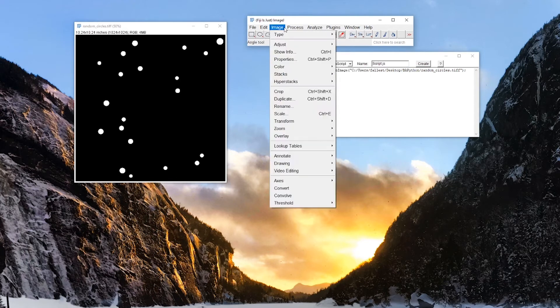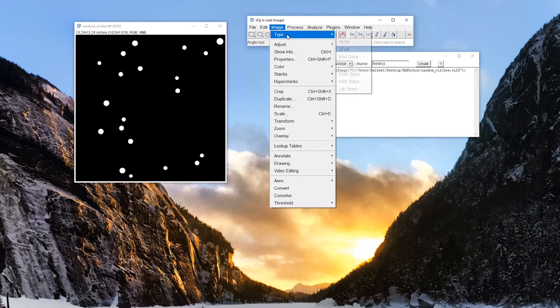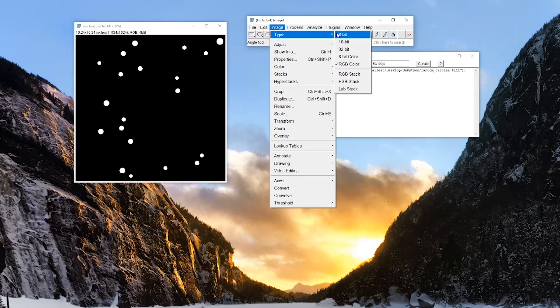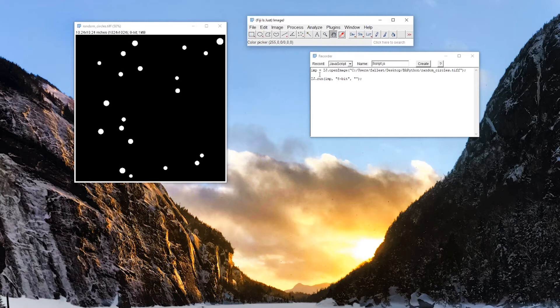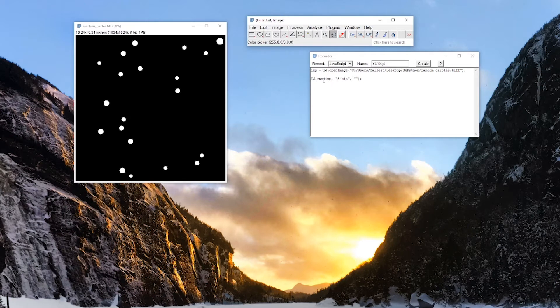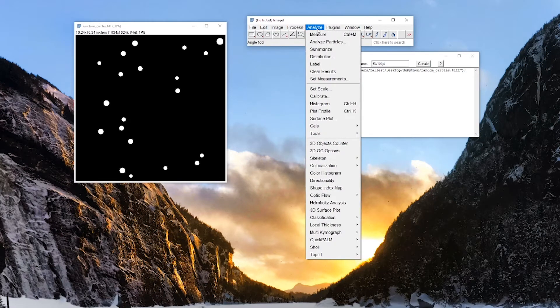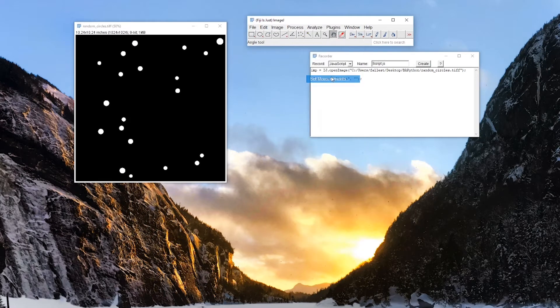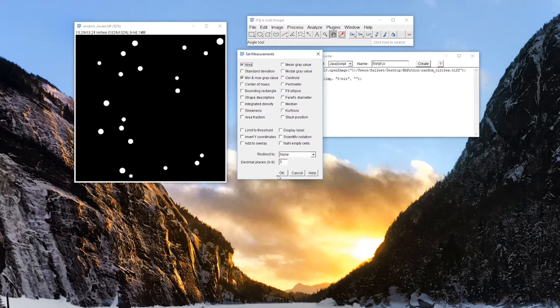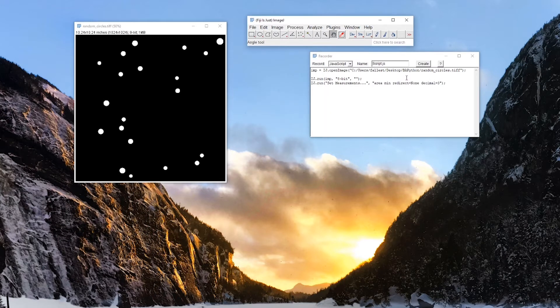Let's go back, image type, 8-bit. So IJ.run imp. So it's taking this variable here, imp, putting it into the function run. So IJ.run imp, and it's just launching 8-bit on it. All right, so now we can set the measurements we want. Area, min, max, gray value. Okay, so IJ.run, set measurement. So it's just running that function right out of Fiji.